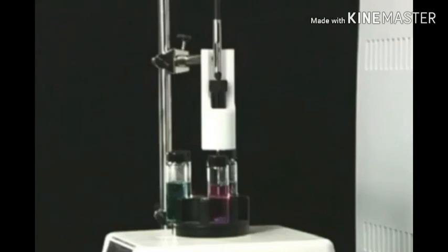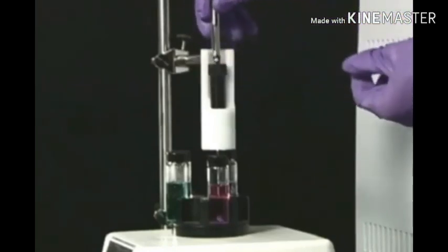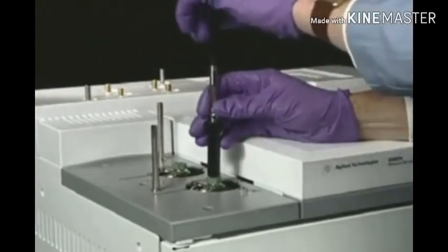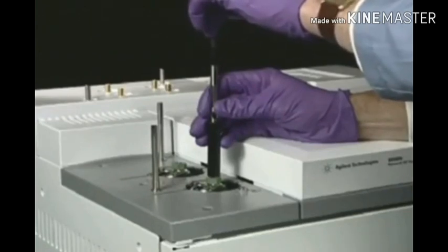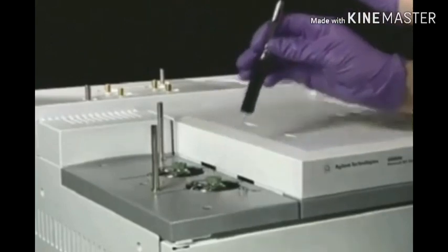After a predetermined time, the SPME fiber is retracted into the protective needle and transferred to the GC for analysis. Inject the SPME fiber into the GC injection port, where the collected organics are quickly transferred to the GC column by heating the fiber. After the thermal transfer of analytes is completed, the fiber is removed and inserted in the next sample vial for extraction.